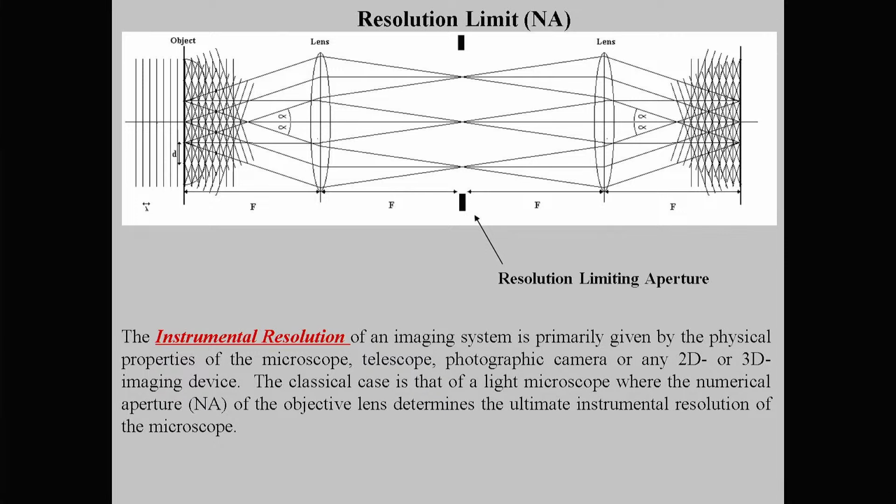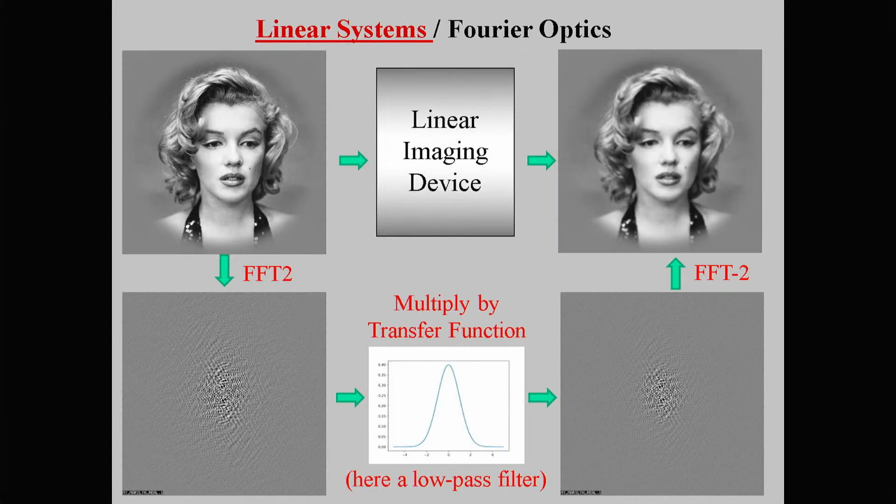The illumination system of an electron microscope is the same. It's not the way you are used to thinking of it, in terms of C2 and C3 and whatever, but there is a very clear, simple mathematical story behind this. And this is a linear system. What does that mean? Well, you have a Fourier transform of the object to here, another Fourier transform does this. And that means that you can predict things very precisely.